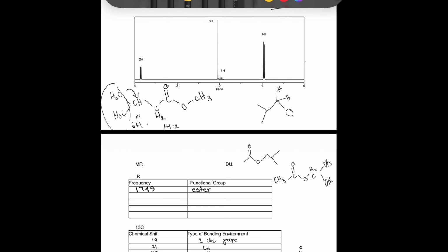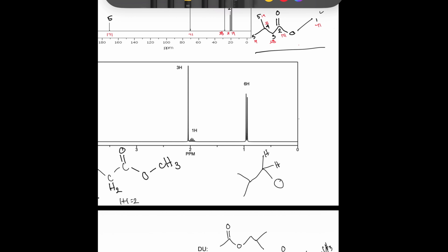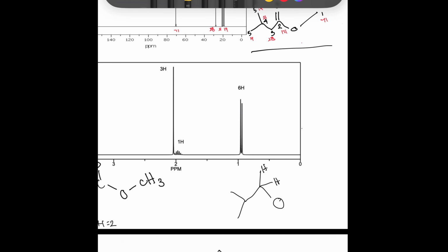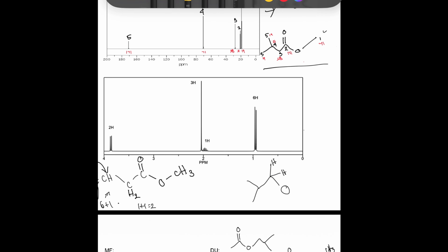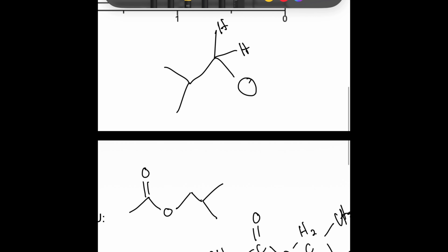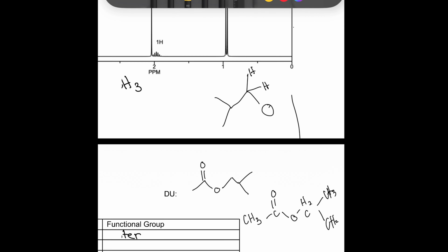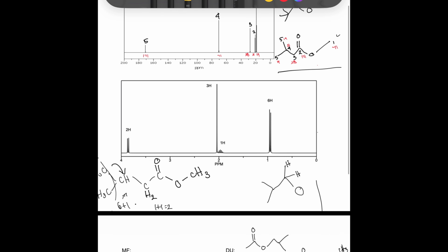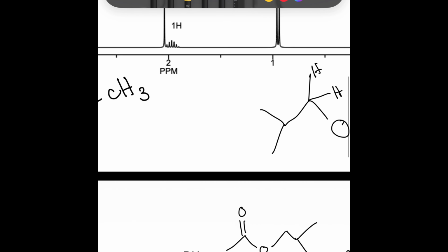So if we compare this now, looking at our proton NMR spectrum again, we can see that this remained the same. These 2, this 6H, this gives us the right range. This structure right here corresponds with these right here, and that will give us that range. And you see that these little peaks, that's the multiplicity. So that checks out.